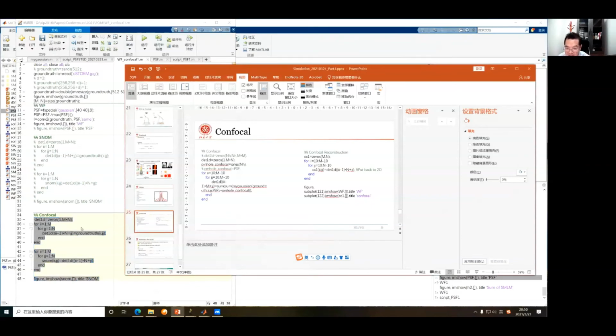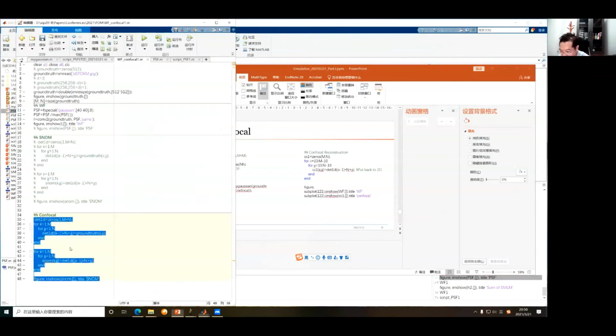So once again I need a detector 1D, but now I need first to have a small piece of my image, a sub-image generated from the original ground truth image.